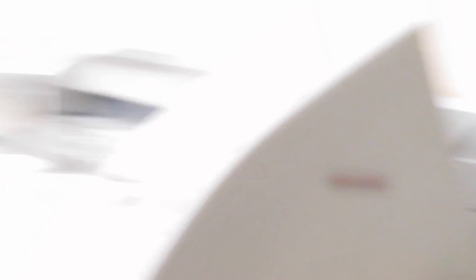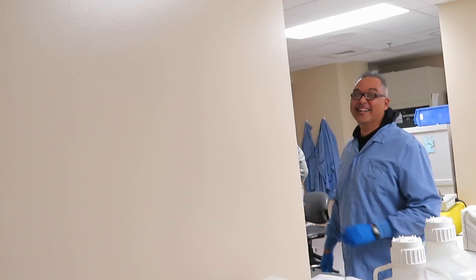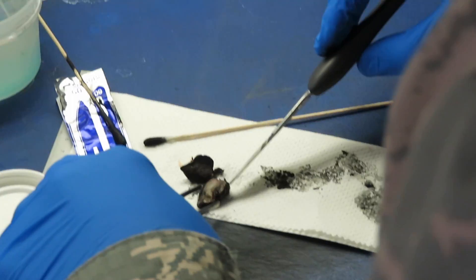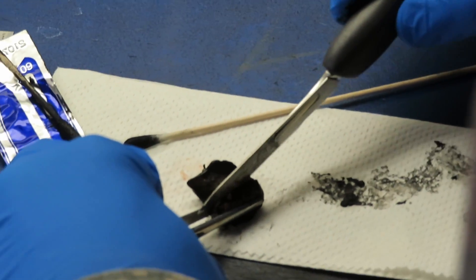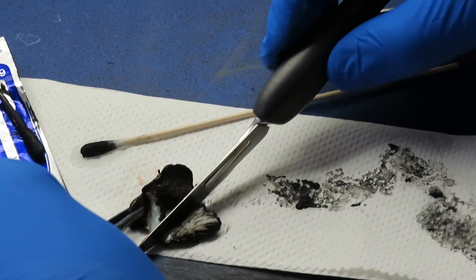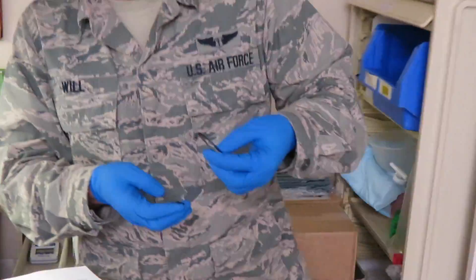So once we ink it — the reason we ink it is in case the cancer goes to the outside, or touches the ink, that means there's probably cancer still inside the patient's body. The surgeon just got an incision here. Let's put a thin cross-section so it's easy to freeze.